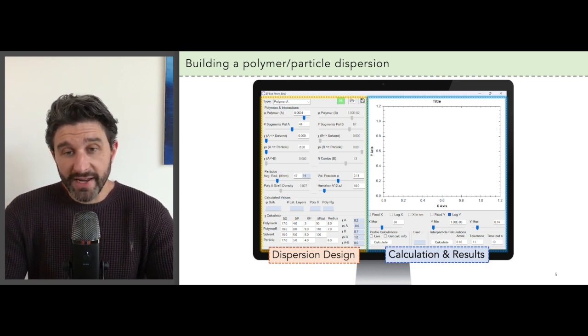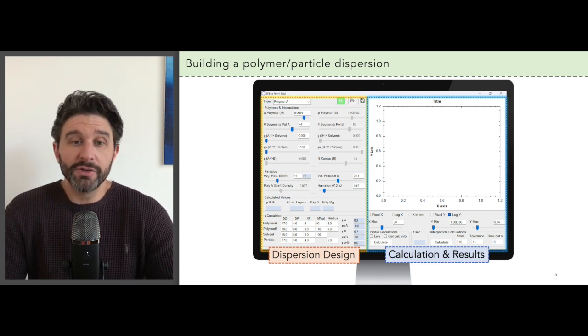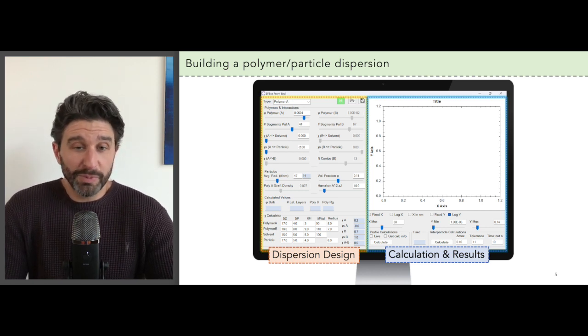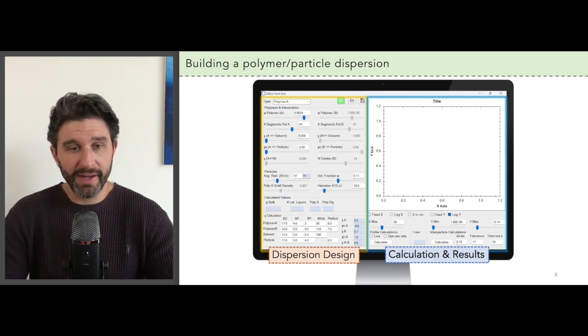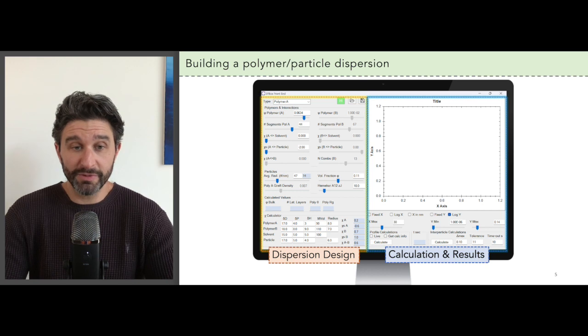Turning over to the right hand side, this is where you perform the calculations and view results. This is just a simple plotting window, and then at the lower right you have a series of controls to set up how the plot looks and also the buttons to perform the calculations.